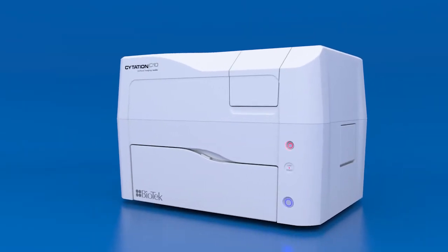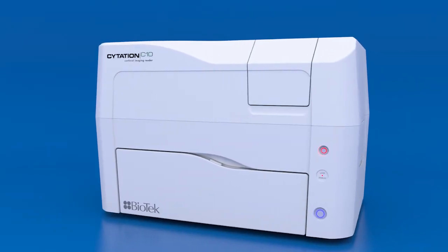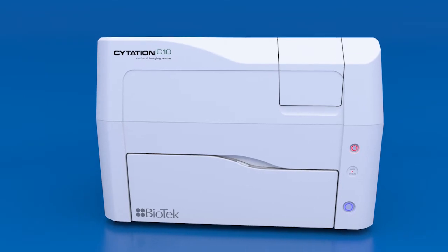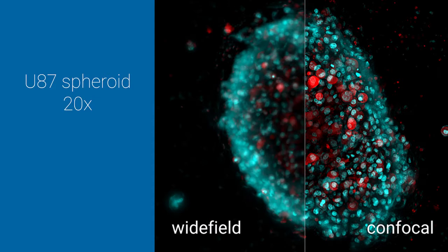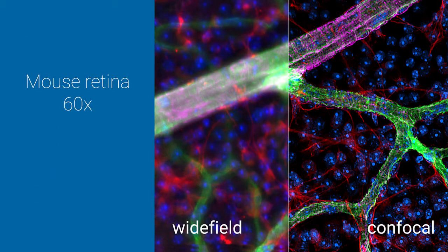The new Citation C10 confocal imaging multimode reader brings unprecedented functionality within the typical laboratory budget. Spinning disk confocal microscopy enables in-depth research that is not possible with a wide-field only system.